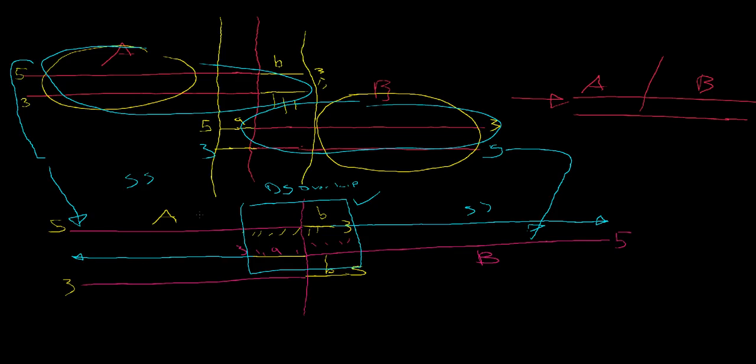So in this very first round, you can see that we had this overlap. So two different DNA fragments that share just a little bit of homology annealed at their overlap, and then we extended that overlap in order to create a new piece of DNA, so we were able to splice together A and B. And that's kind of just the first step, and after that we just have to amplify that.